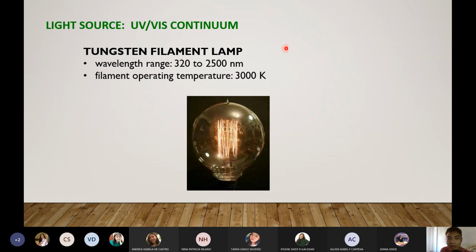So one of which is the tungsten filament lamp. So basically, parang ito yung typical na bumbilya before, no? You have a tungsten inside, which is a metal. Okay? And when that metal is heated, it glows, no? Okay? So ito yung isa sa mga reason bakit nagtataka yung physicist dati. But kapag yung matter, ininit mo, nag-glow. Okay? So yan, as a result, ang dami nilang equation na binigay sa atin, which is inaaral ko ngayon na nakakaiyak. Okay. So anyway, so ito, tungsten filament lamp.